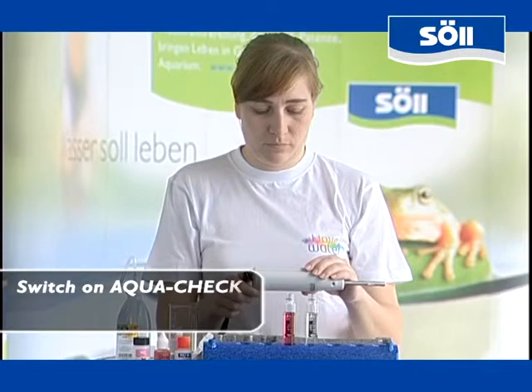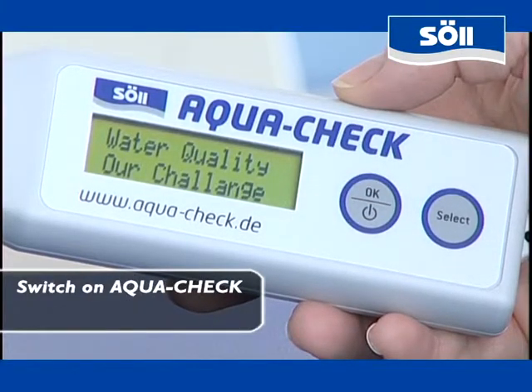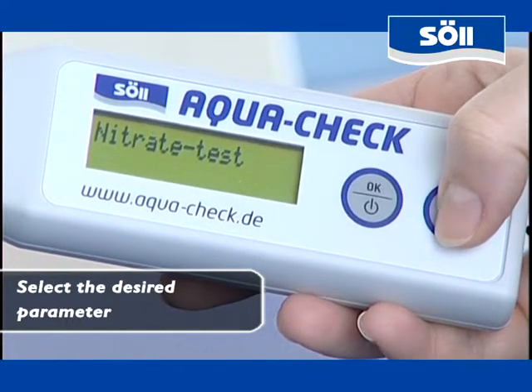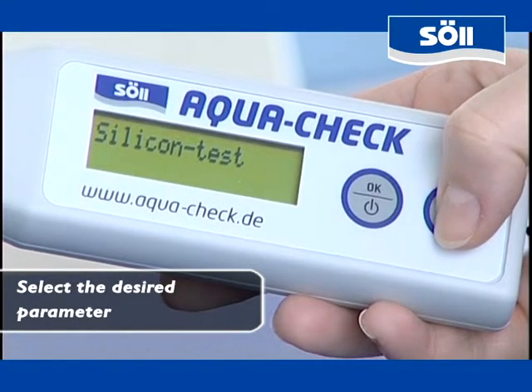Now the preparations are already finished. Switch on AquaCheck by pressing and holding the power key. After the welcome message has been displayed, continuous pressing of the select key guides you through the menu. When you have found the desired parameter — in this case the pH value — please confirm your choice by pressing OK.